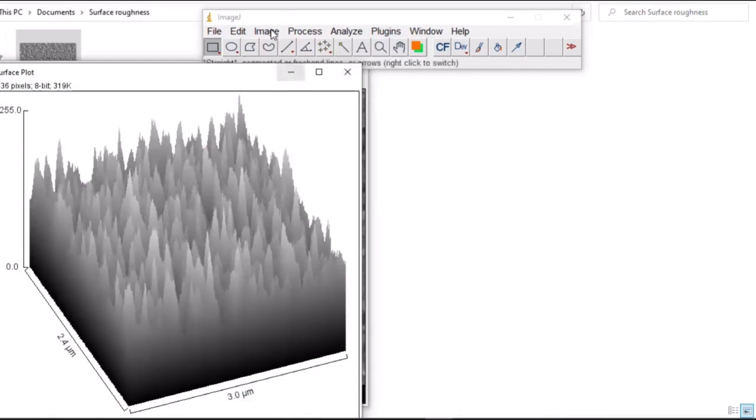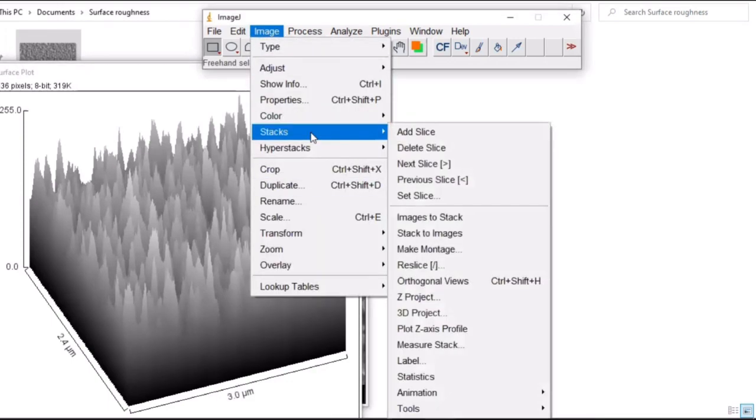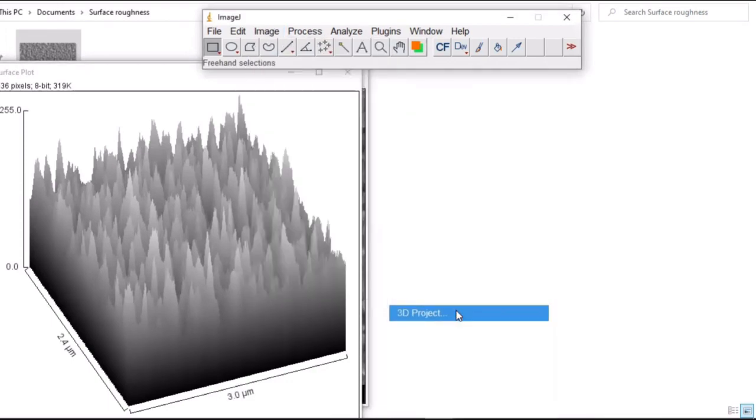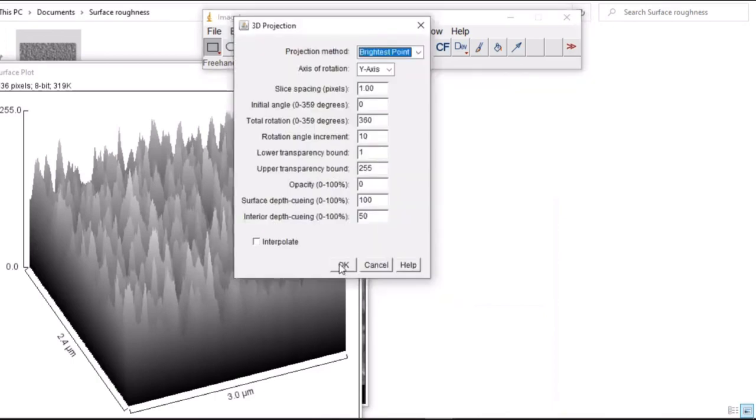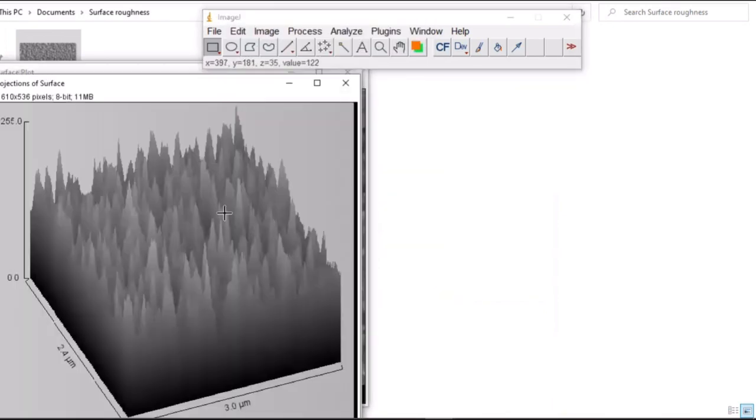You can also make it or project it in a 3D form. Go to 3D and project it. OK. You have it here.